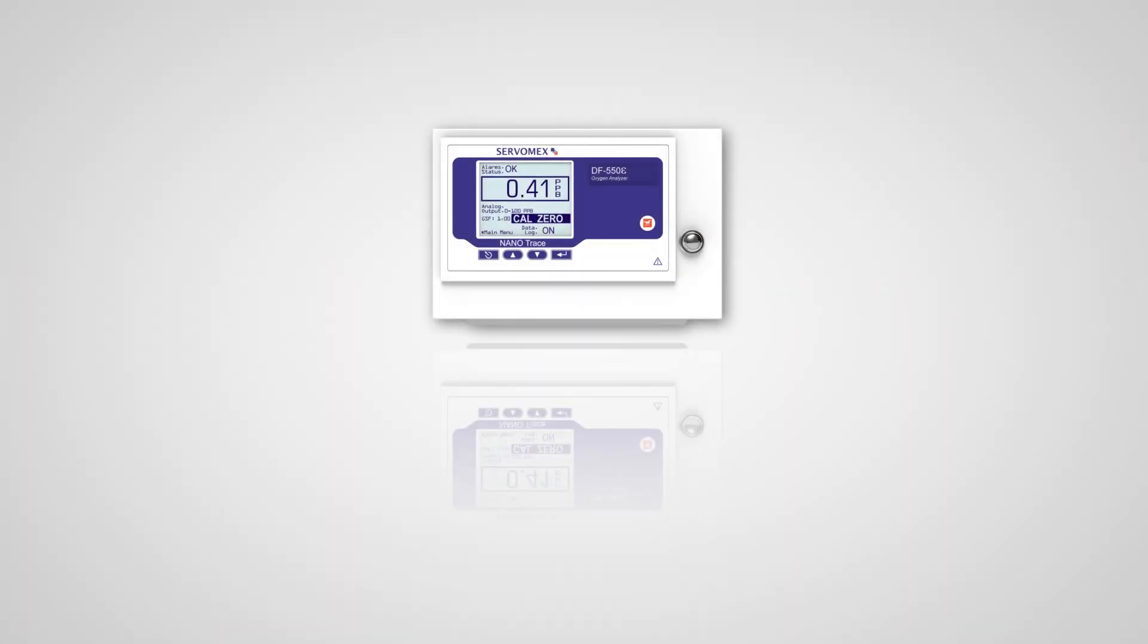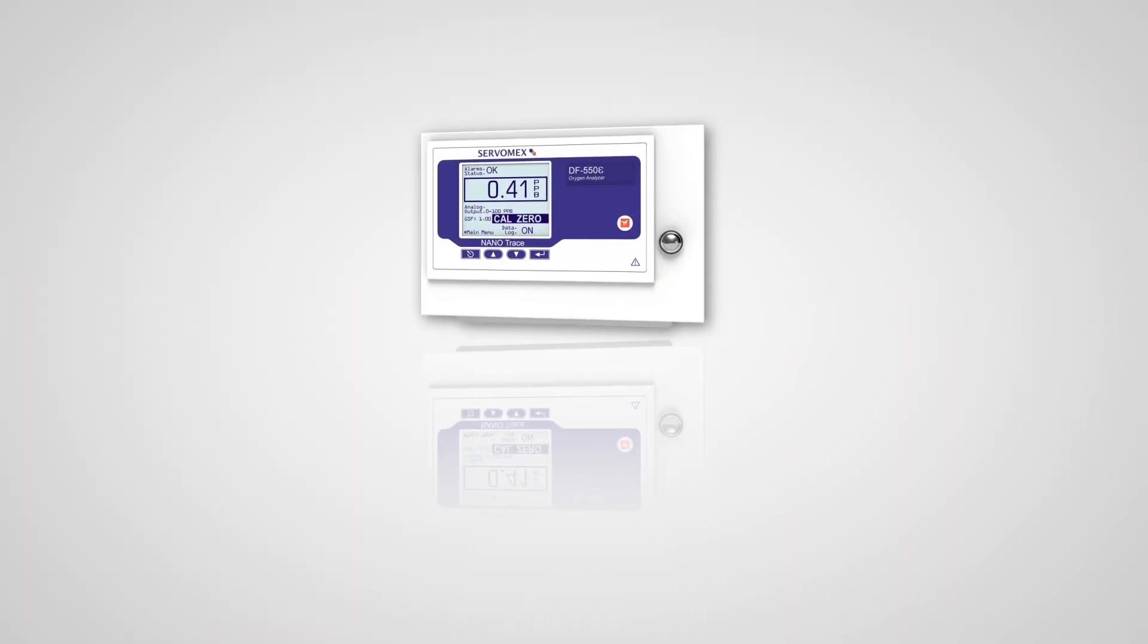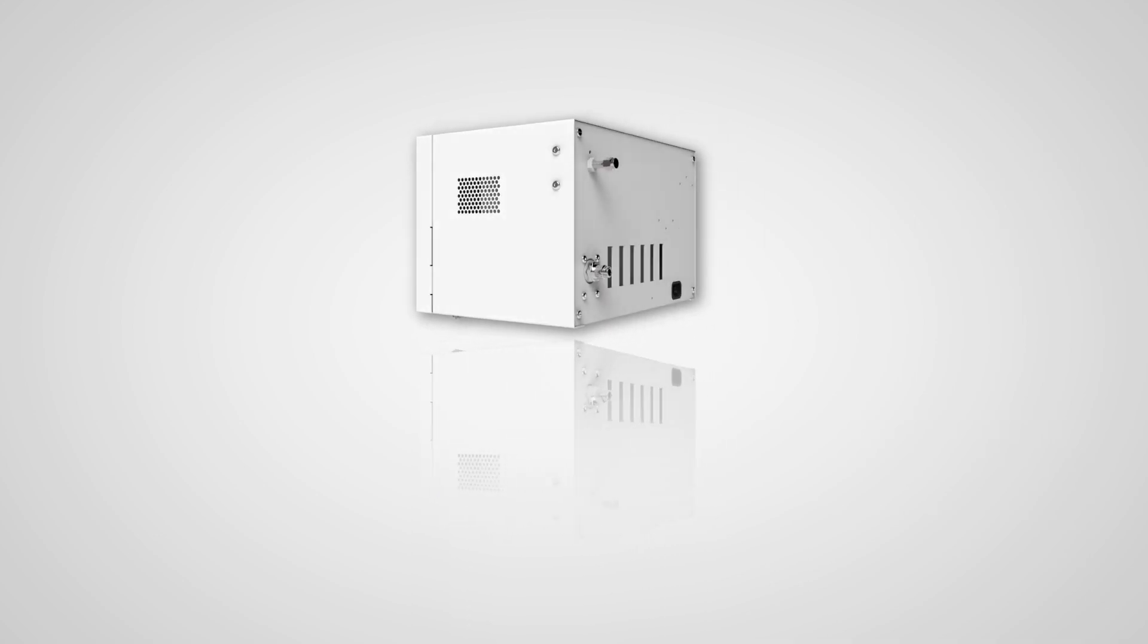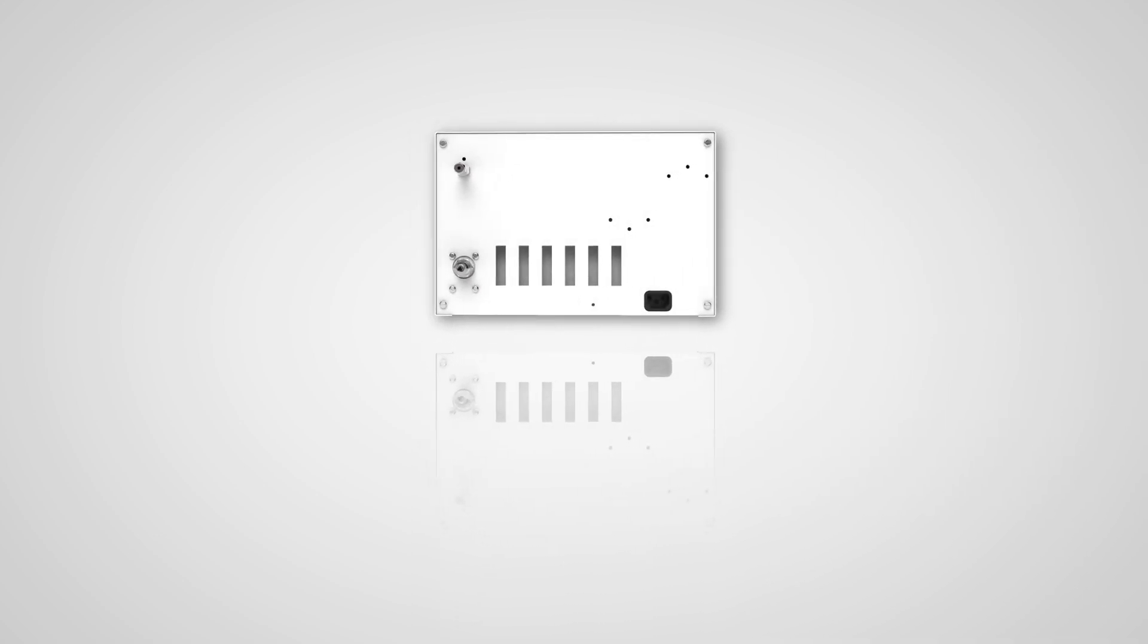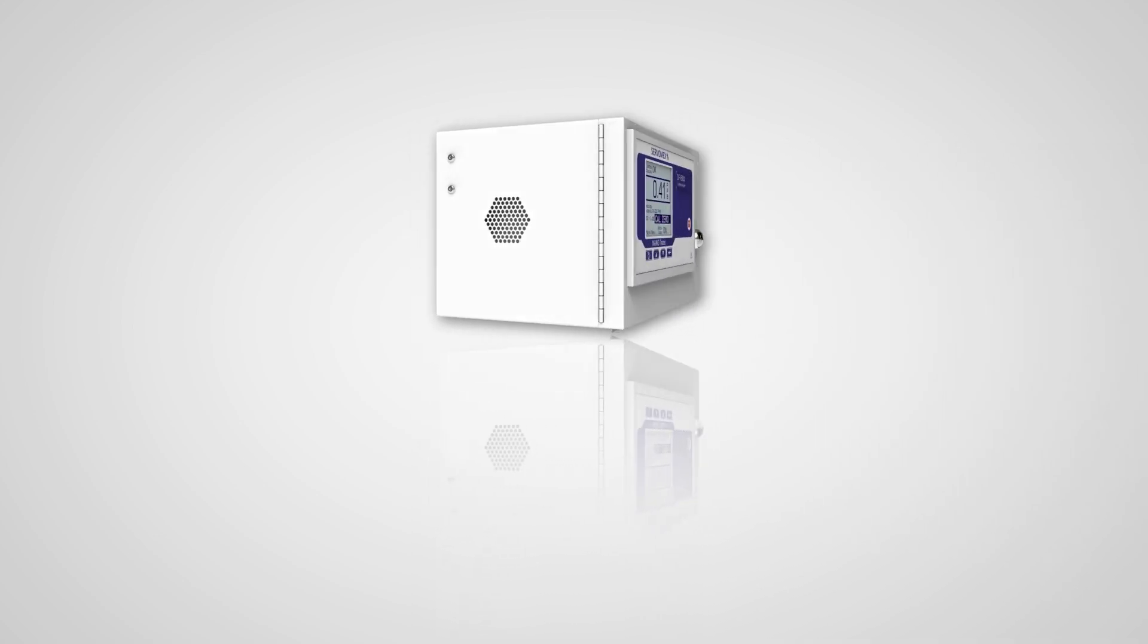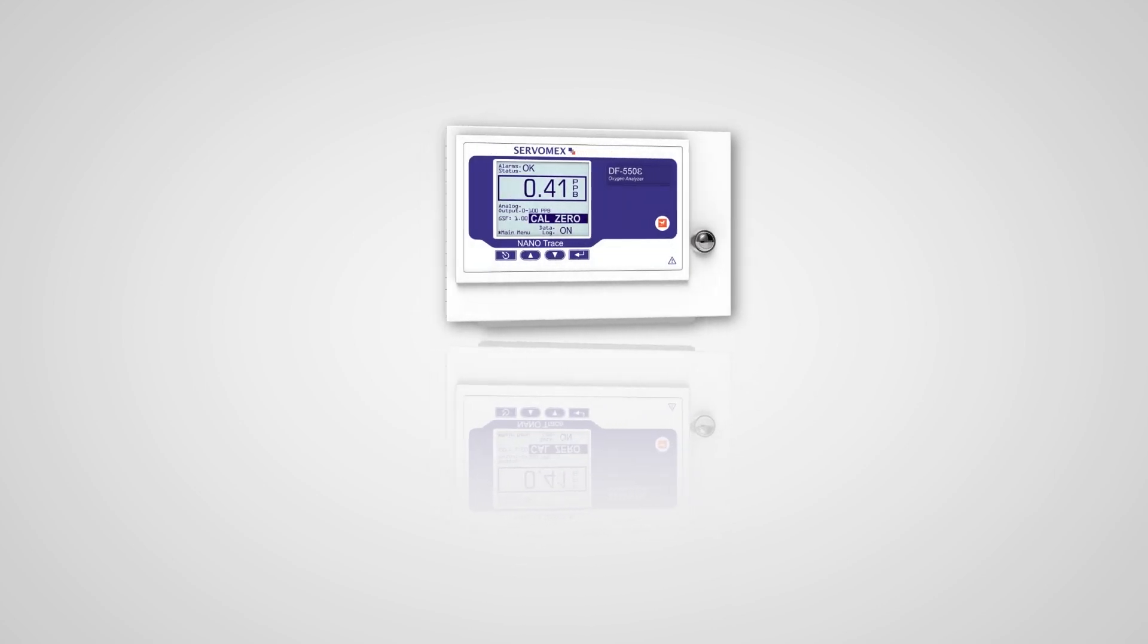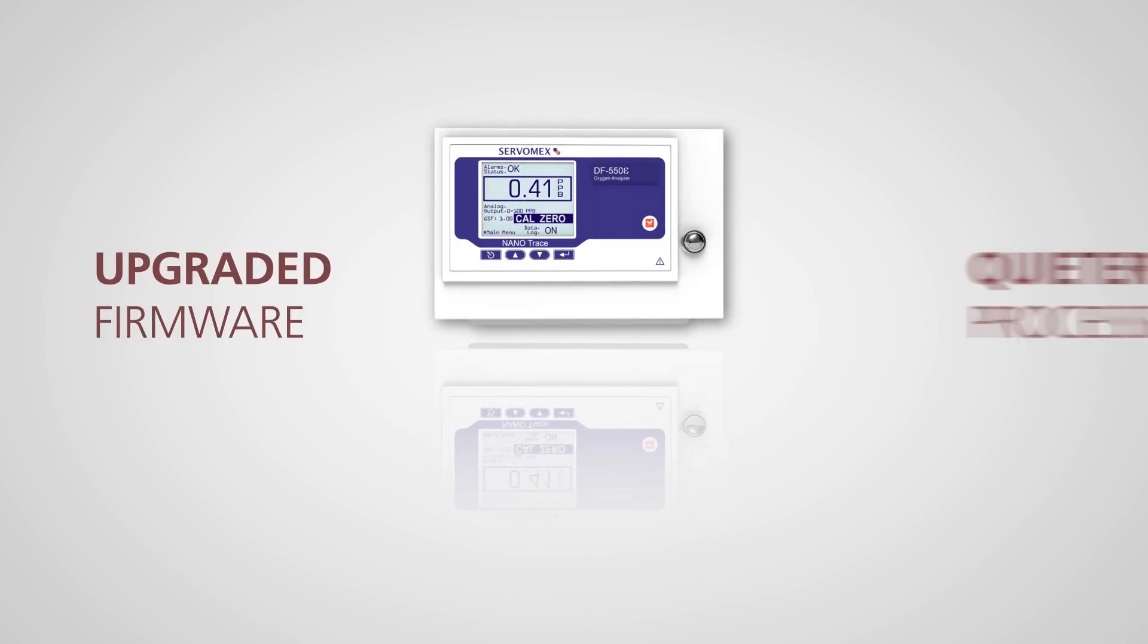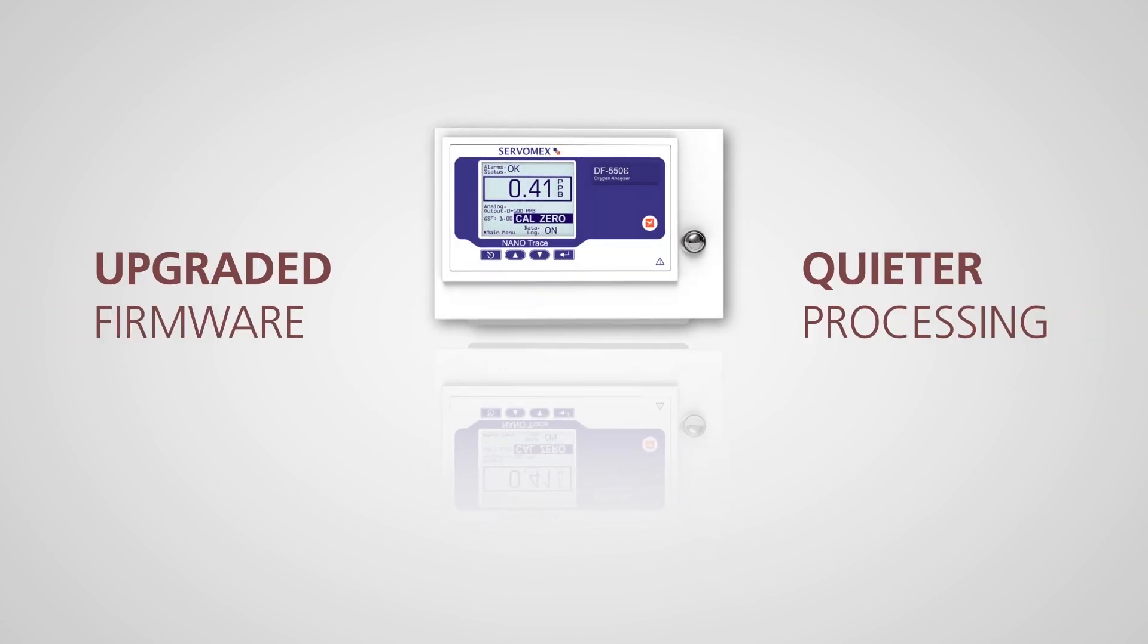From Servomex, the world leader in gas analysis, the DF500 Ultratrace Oxygen Analyzer series, now improved with upgraded firmware for quieter processing.